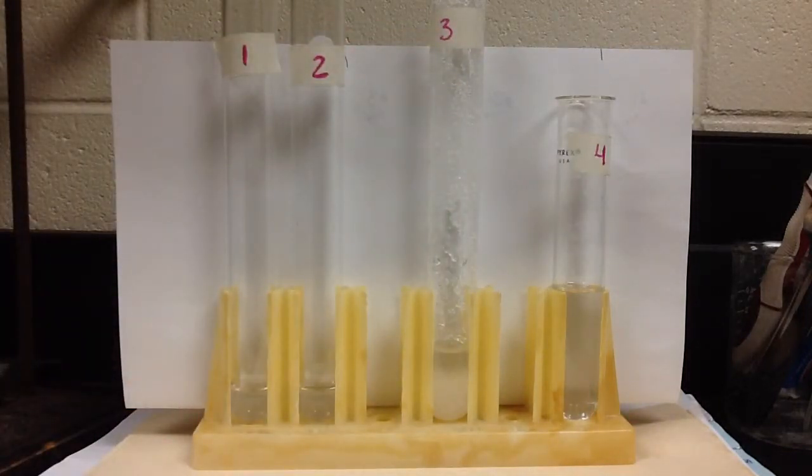And what we have in test tube number four is sort of the outcome of that. So what we did is we heated it all up, we got it to dissolve, and then we slowly cooled it back down to room temperature. So once we got back down to room temperature, what did we do? We added one solute crystal.